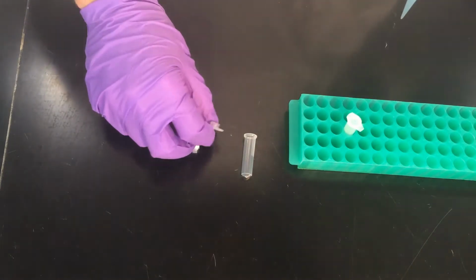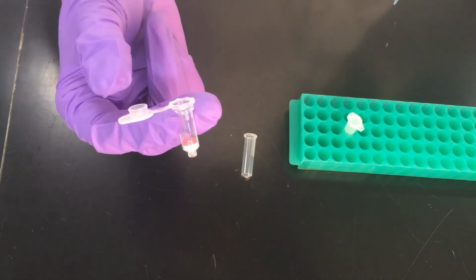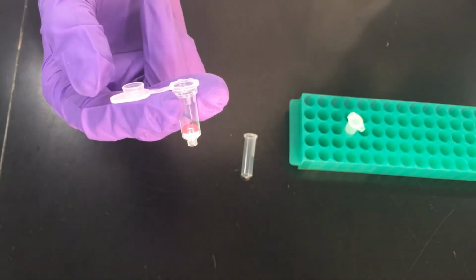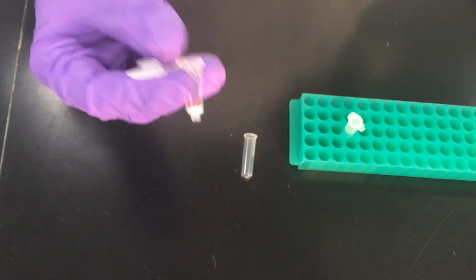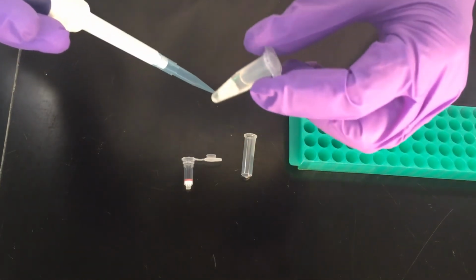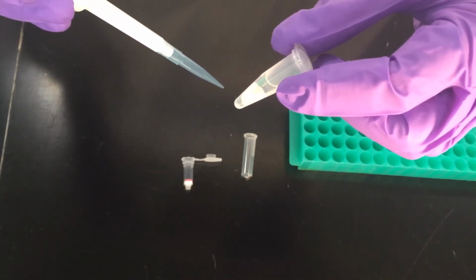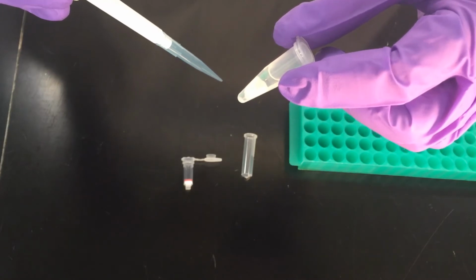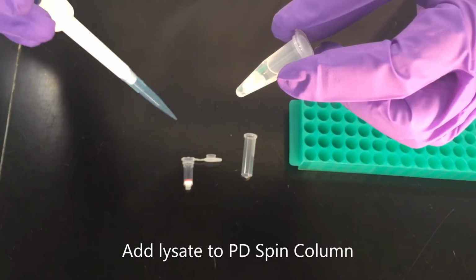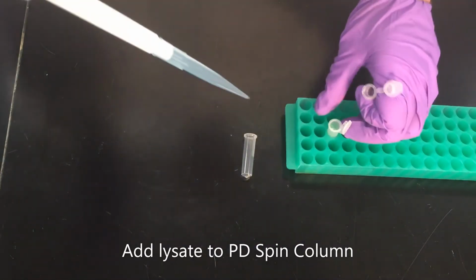So what I'm going to do now is use one of these little spin columns. So this is the technology that comes with the kit. That little white filter at the bottom is a special glass filter that is designed to bind DNA. So at this point, the liquid that I have in my tube from the previous step is going to contain anything that's soluble. So we're looking at all sorts of electrolytes in the cell, maybe glucose, all sorts of things like that. And of course the plasmid DNA. So I'm going to apply this liquid here to this column, and then hopefully that will bind the plasmid DNA.